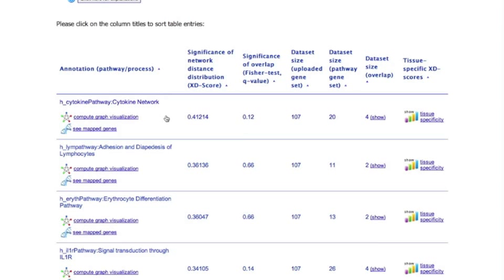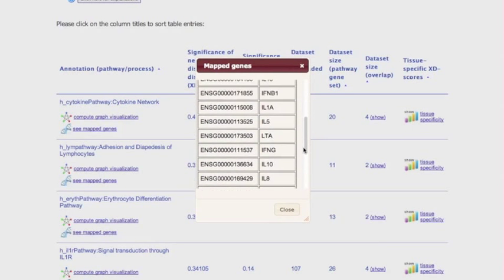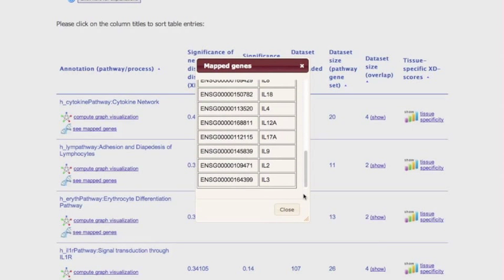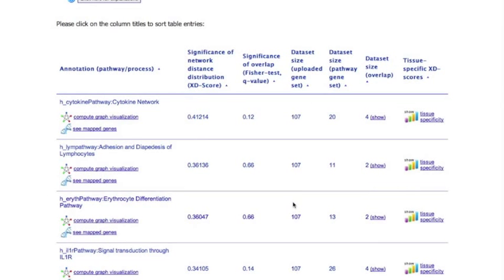First, we can check which genes in a pathway were mapped onto the molecular interaction network by clicking on see mapped genes. Then we can inspect the subset of genes that are shared between the user-defined gene set and the pathway.